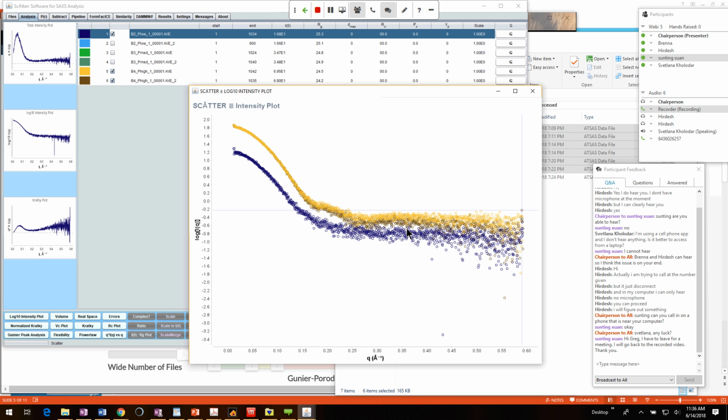And remembering your sample, because I remember looking through it with Catherine, your sample is quite sensitive, and that's fine. What I saw mostly was that you could take the first 2 frames most of the time, and it would still be fine. You can also see how quickly the radiation damage occurs. Let's say your frame 1 and frame 2 are slightly different. Then you can extrapolate from that what frame 0 would have been like, the effective change because of radiation damage. From going through your samples, it doesn't look like there's a gigantic step between 1 and 2, so I think you're pretty good.